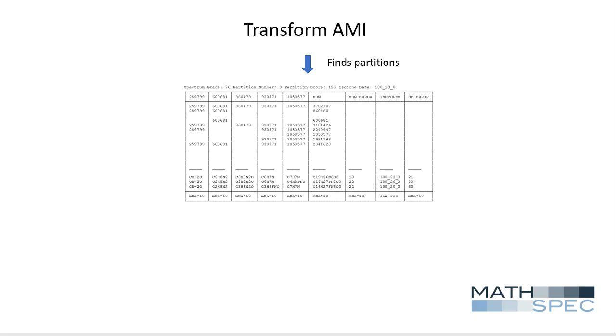Transform generates sets of subfragments and subformulas that are rough models of an unknown analyte. For many types of studies, for example, identifying reaction side products, the mass spectral data will take us only as far as these rough models. We need to then use background information to hypothesize possible molecular structures from these transform results. However, because the analyte with a mass of 370 was found in 3 different surface water samples, there's a high probability that this analyte is a known compound found in the massive Pubchem compound database of 124 million compounds.